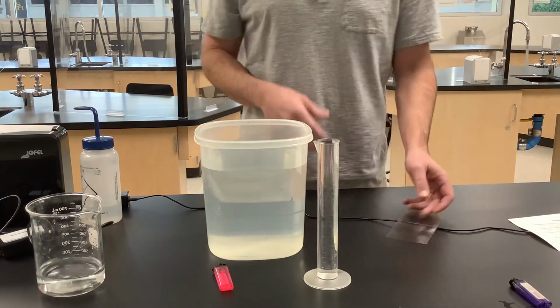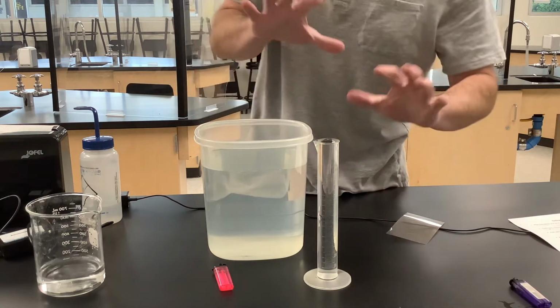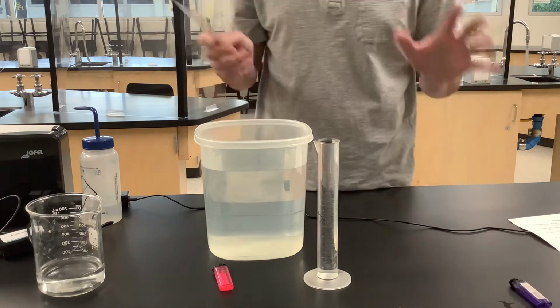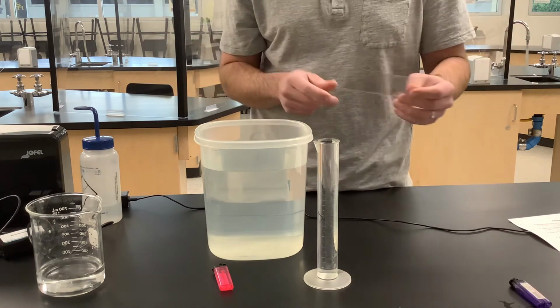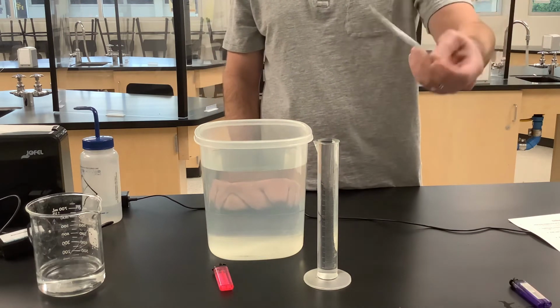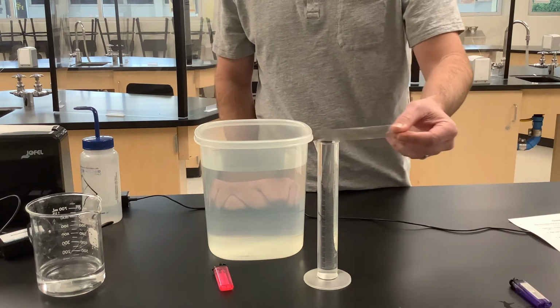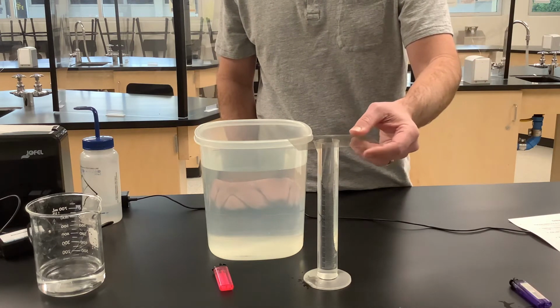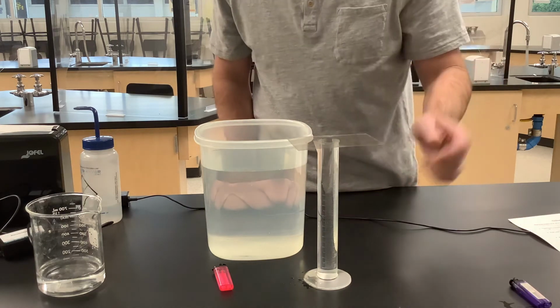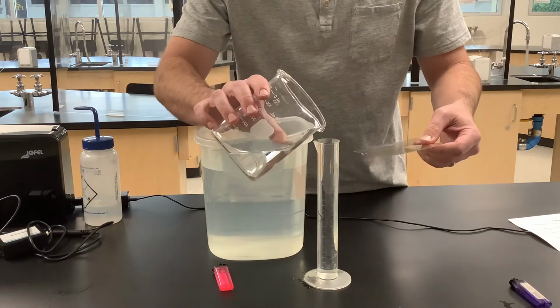Now what you would normally do is put your hand over it and try to submerge it that way, but we don't want to get any air in it. There's actually an easier, and kind of fun, way. We've talked about the power of the atmosphere around us, and we can use it. I just have a little piece of plastic, but this would work with a piece of paper or anything like that. I'm going to set the plastic on top here, and I made a bit of a mess. I got one tiny bubble in there I don't really like, so I'm going to try and get that out. Looks like it popped.